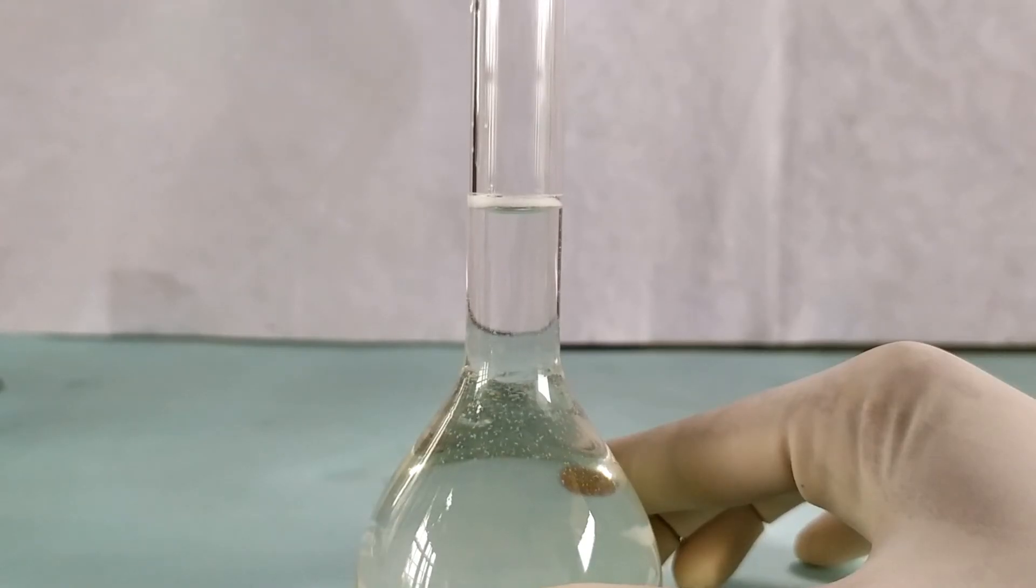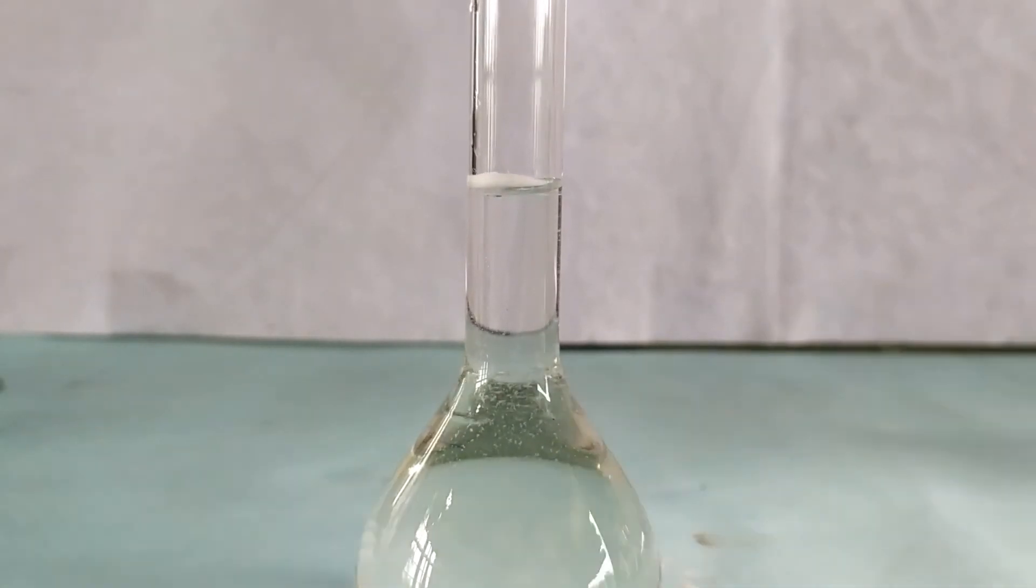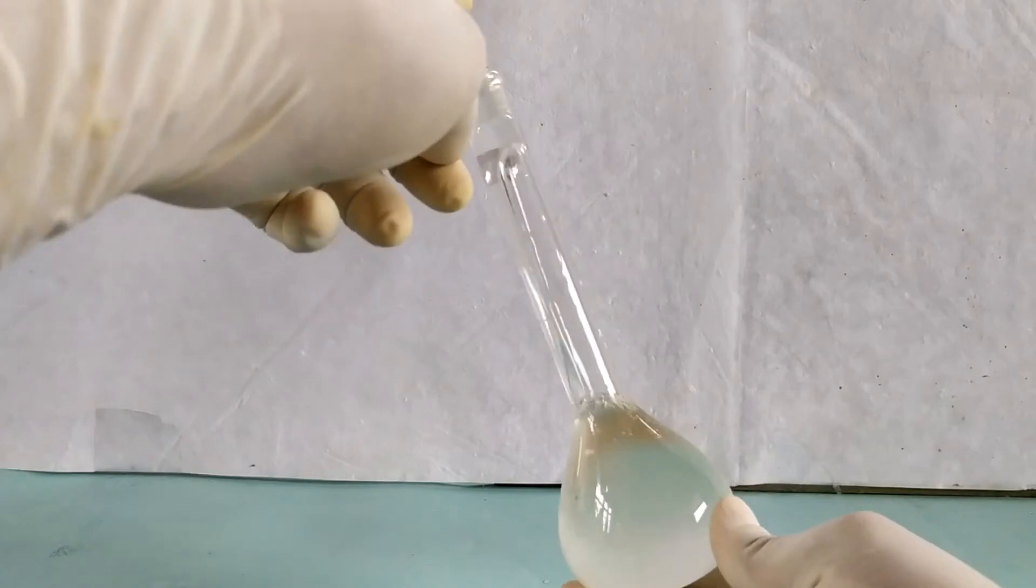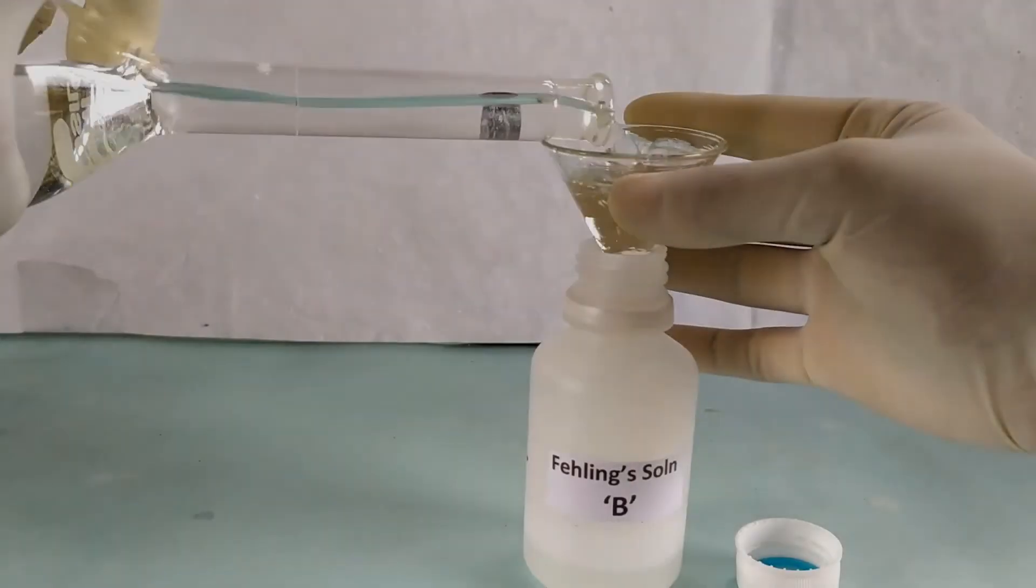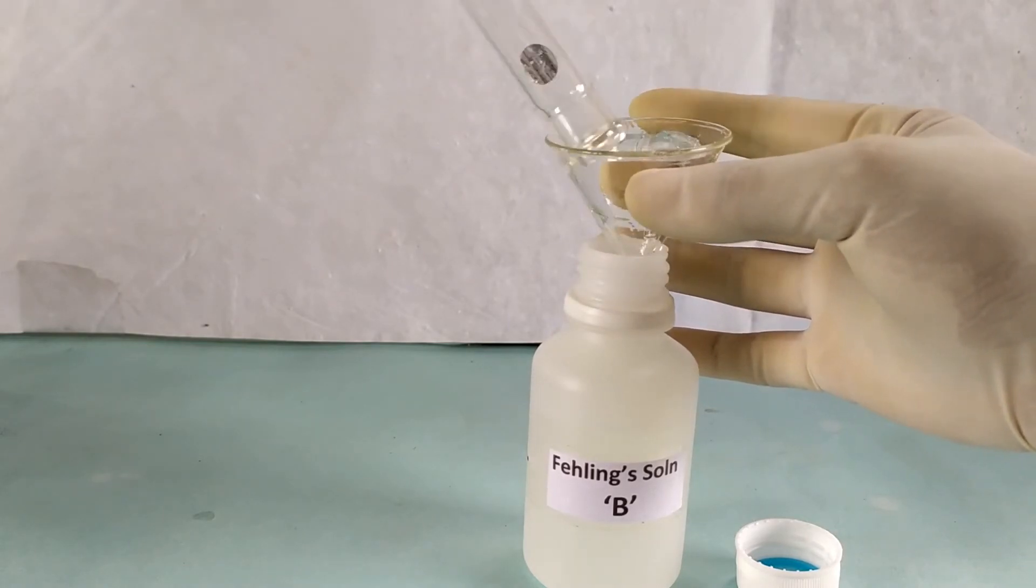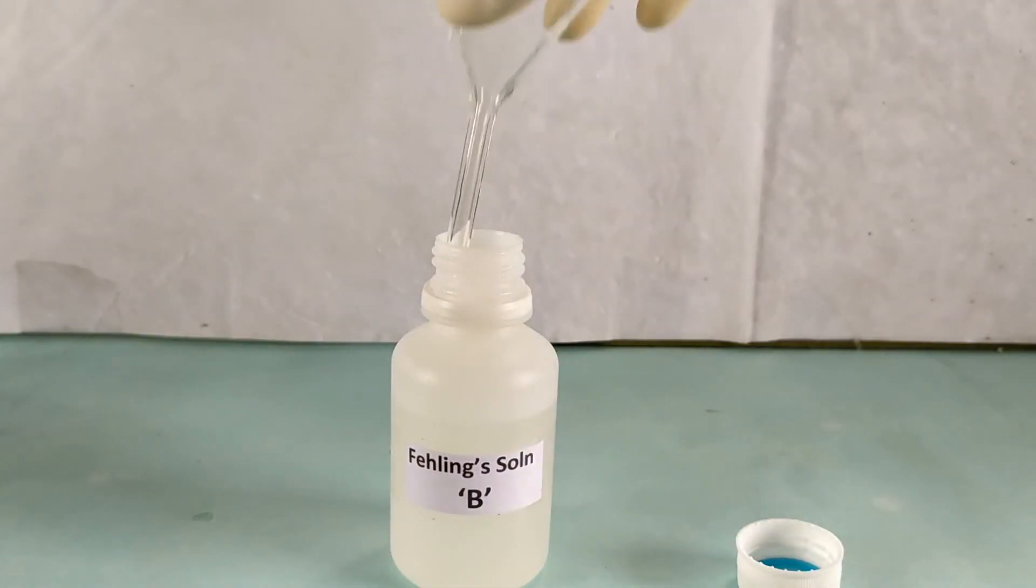Make up the final volume of the flask to 100 ml with distilled water using a dropper or a pipette. Mix the contents well by inverting the flask several times. Transfer the resulting solution into a container with a tight-fitting cap and label it as Fehling's solution-B.